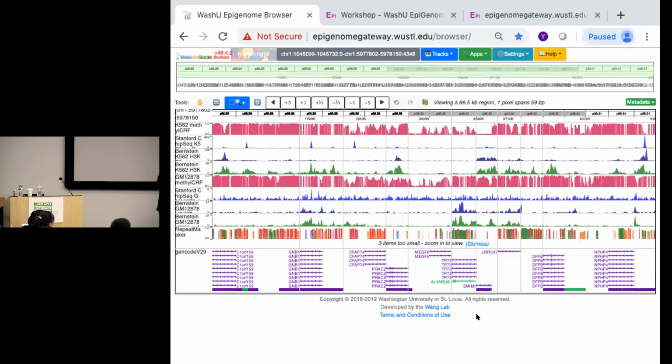Demethylated in the middle, with the ChIP-seq peak here for transcription factor JunD, H3K27 acetylation, and H3K4 monomethylation. So that's centered on that transposable element. In the same region in the GM line, this peak is shifted to the side, but because we have that 2KB context, we can see this. So this is the first example. Now looking at these 20, there are actually more such examples.